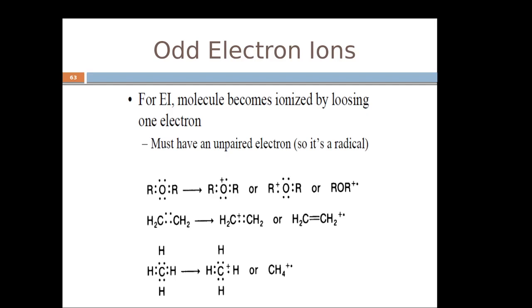And usually, as we have seen in electron impact ionization, as the beam encounters the molecule, it will knock off one electron from the molecule, and then the molecule will be left with an unpaired electron, and then it will form a radical cation. Okay, so that means in order to make a radical cation, the molecule should also already have electron density, or pi electron density for that matter.